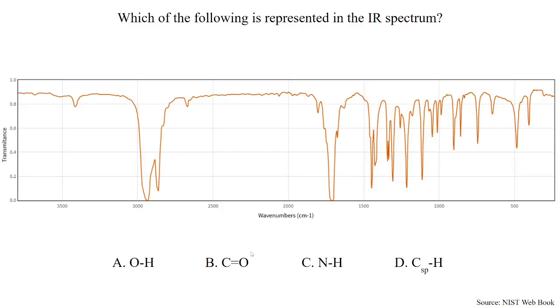And a lot of people ask in the in-person meeting, we have these functional groups like a carboxylic acid, ketone, anhydrides, esters, aldehydes, where they all have a carbonyl peak. How would I know which functional group is being displayed in this IR spectrum? And I guess the answer is you can't. IR spectra tell you the functional groups within a compound but can't determine whether it's an ester, carboxylic acid, ketone, or any of those functional groups that have a carbonyl group in it. You're going to have to rely on other spectroscopy techniques like NMR spectroscopy or mass spectroscopy to help you determine those. Right?